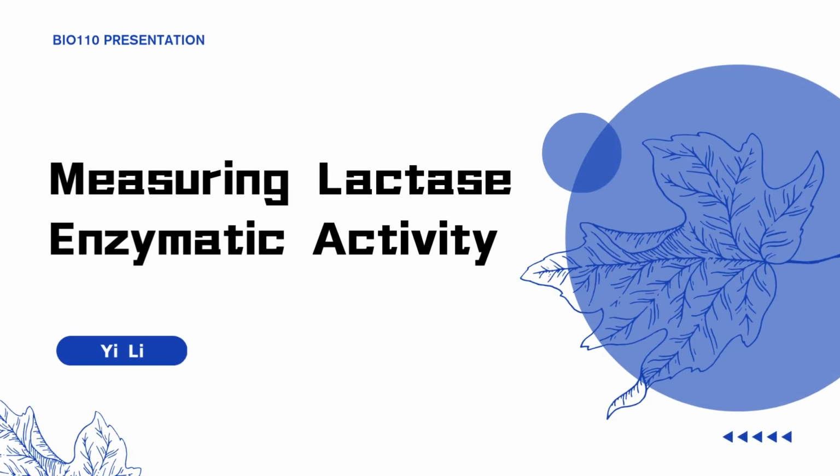Enzyme activity drives biological systems, but how do we capture its invisible reaction? By quantifying substrate depletion or product formation through spectral photometry. We review catalytic efficiency under controlled conditions. These measurements bridge biochemistry to medicine and biotechnology. Let's decode the kinetics.